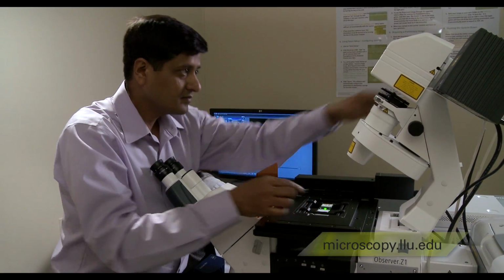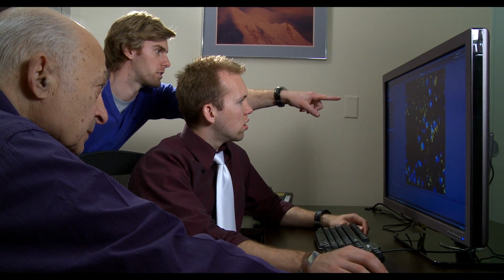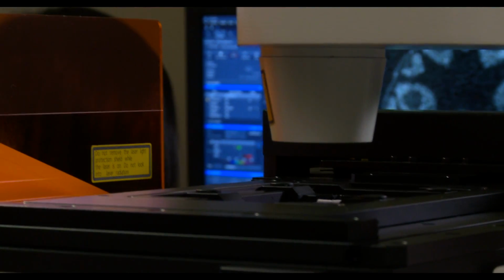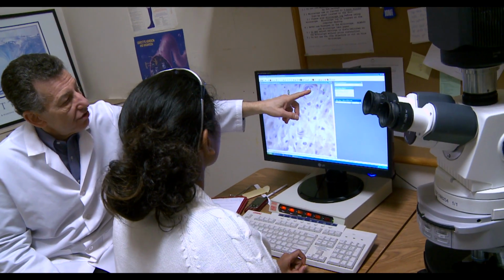This facility, with its laser scanning confocal microscopy, enables us to do a multidimensional look at tissues, which is truly transformative. Things that we couldn't see before are now able to be visualized. The impact of this facility has already been felt by it being incorporated into multiple grant applications, which have gotten reviews from the National Institute of Health as having been an outstanding core resource for applications.